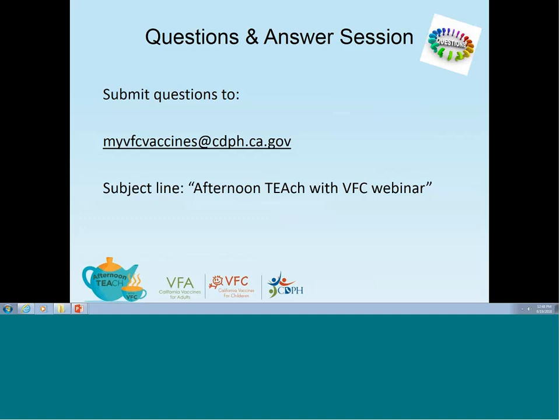Well, I'm just going to ask you this as a quick question. Do you have the ability to scan those readings or that report into the computer so that it's saved electronically? Yes. Because that's what we strongly recommend. Save all electronic forms and all VFC forms for 3 years. So if there's a way for you to scan those documents or get those documents onto some type of USB drive and then save them onto a computer, then you will be compliant. Okay, thank you. You're welcome.